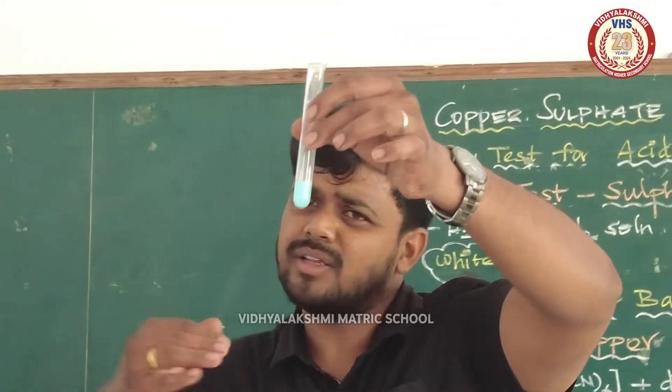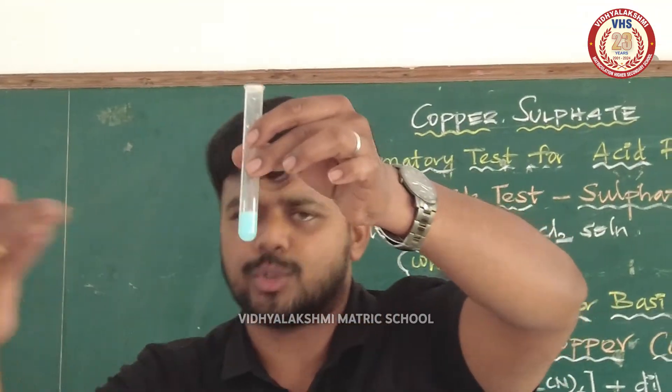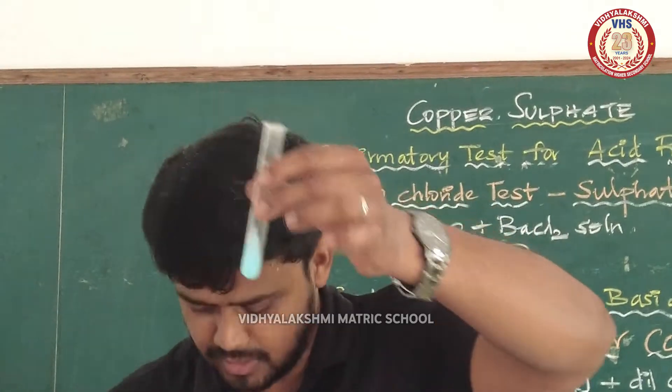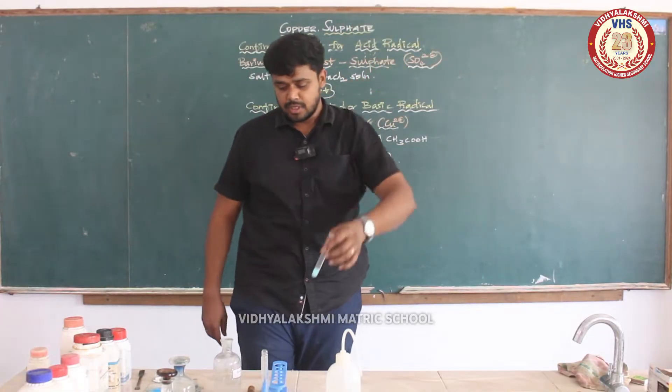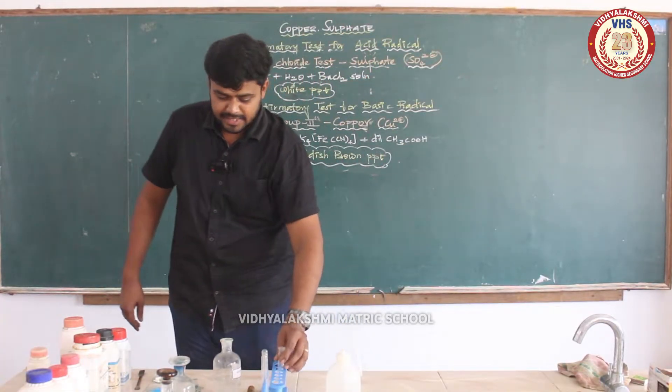On the blue color completely, it turns into bluish white. This is the end point of this sulfate test.